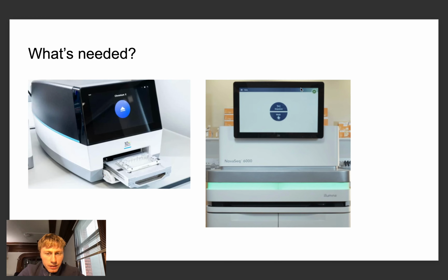And the sequencer, other sequencers exist as well. This is also just a very popular way for the analysis. Then you will need many other things as well, but I will assume either you have those, or they are rather inexpensive to get.